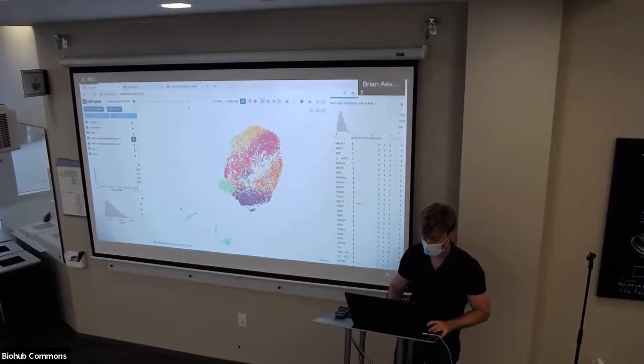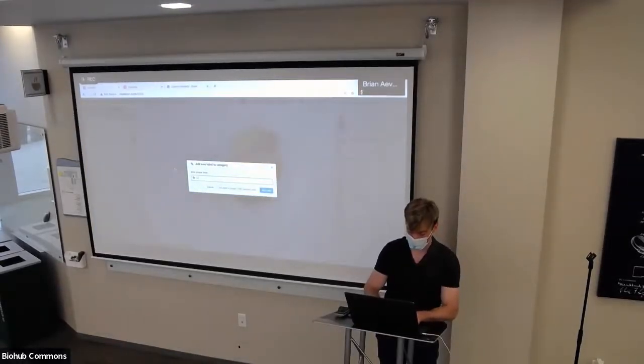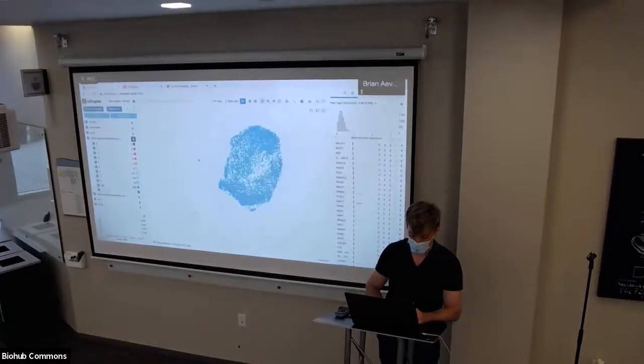So here we've colored, and it's kind of beautiful. We have this thing in its own cluster. This thing kind of got split into many clusters. If we think it's only one cell type, we can basically just do this. We'll expand this. We'll click add a new label to this category, new unique label, blob. Add label, assign. And then we have this new thing blob, and these other guys have zeros now. We could just delete these labels because there are no cells, because we basically overwrote them.